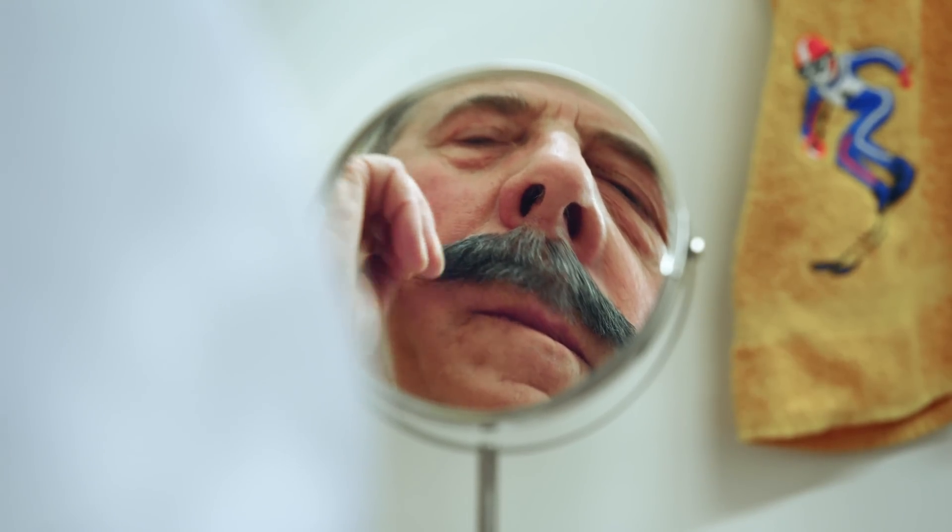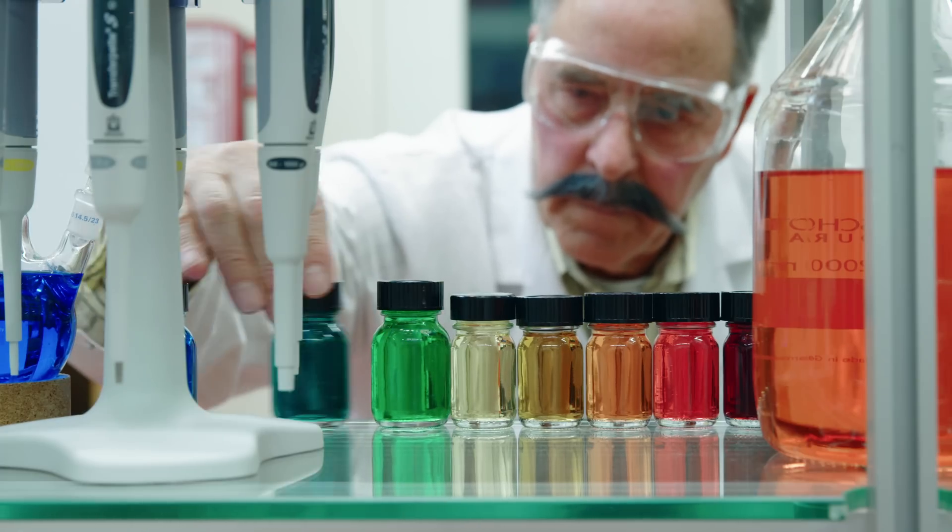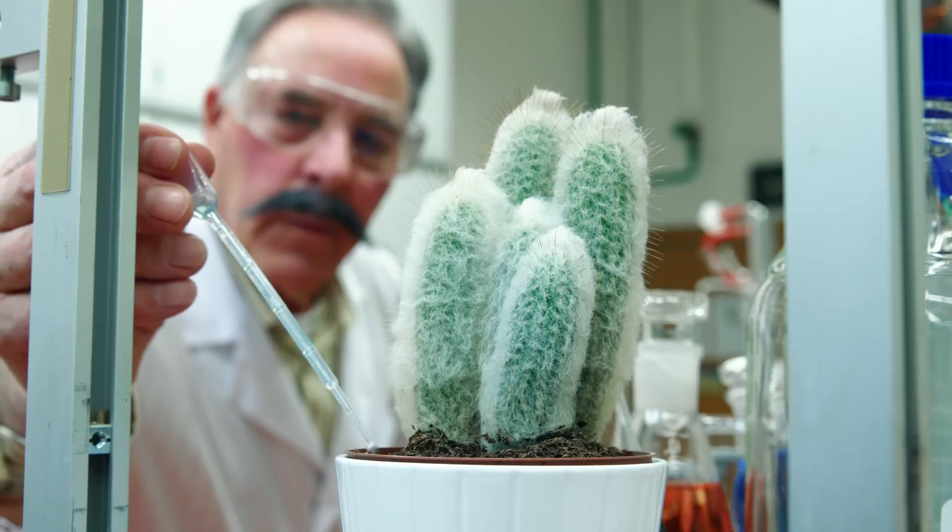Every day, just before half past seven, Mr. Müller gets ready for work. For decades, Mr. Müller has been following the same protocols.